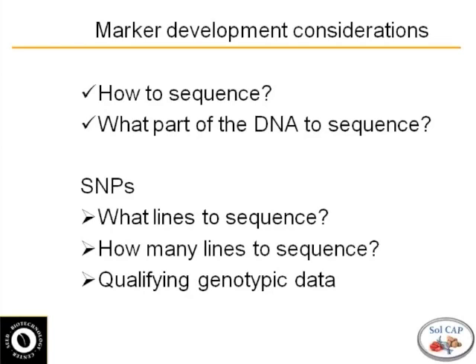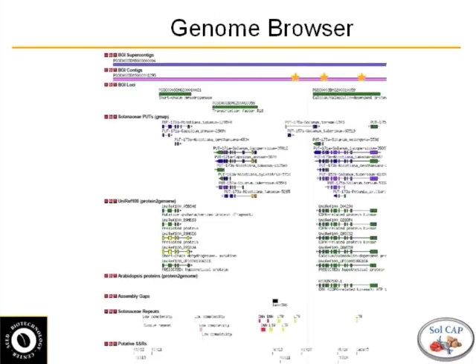I've talked about how to sequence, what part of DNA we sequence, and Heather and David have expanded on how to use that data a little bit more. I'm going to talk more about the basis of the genotyping platform and how we use the sequence at Illumina.